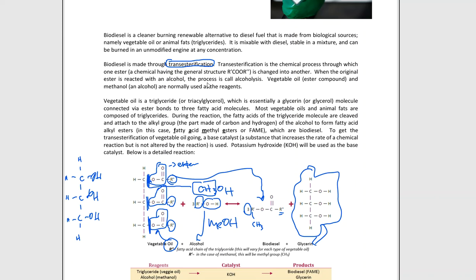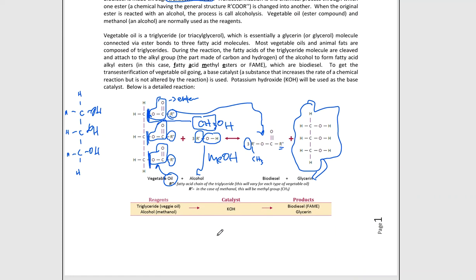All right, so overall, this is the reaction that is going to happen when we start mixing these things together in the lab. A very easy reaction, I might add, to take place. However, it does take quite a bit of time. So it needs a little bit of help. It needs a little bit of patience. But as far as getting the reaction to go forward, there's nothing that I need to do as a user in order to make that happen. I just need to give them a nice little jacuzzi tub for them all to sit in and hang out, so that way they'll get to know each other along the course of time while they're spending that together.